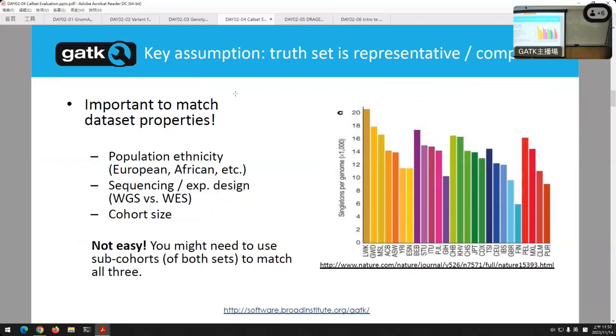Also, the statistics you see depend on exactly what kind of sequencing you did. If you're just doing exome sequencing, that's going to look different than whole genome. Partly, you see different distributions in depth, and different error rates around the edge of those distributions. It's going to look different. Not to mention that when you're only looking at specifically protein-coding regions, the amount of mutations in those regions can be different than looking at other parts of your genome. Some regions are more conserved than others, as you well understand. Also, when talking statistics, you should probably try to keep the cohort size reasonable. Certain statistics shift a bit if you're calling 10 people versus 10,000.